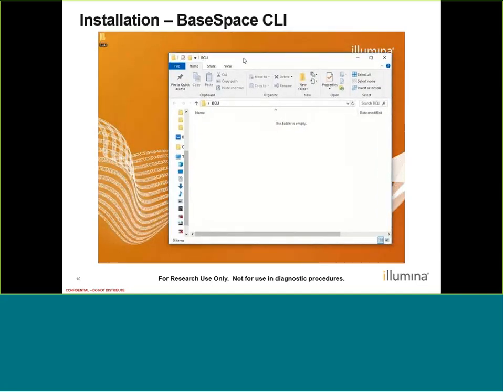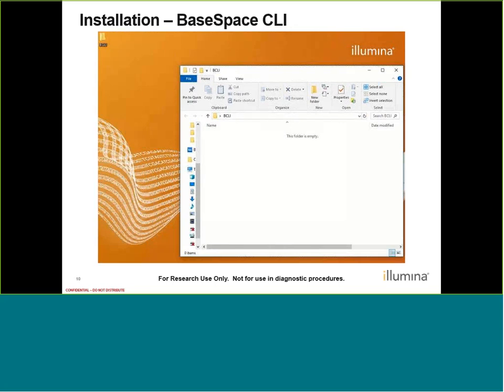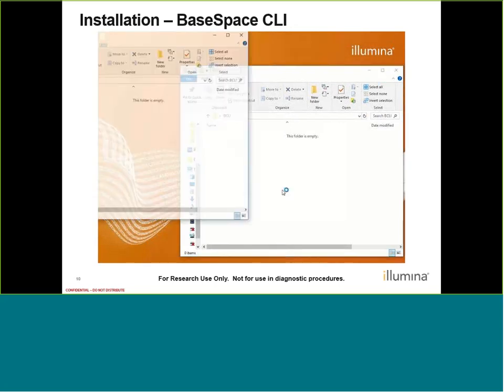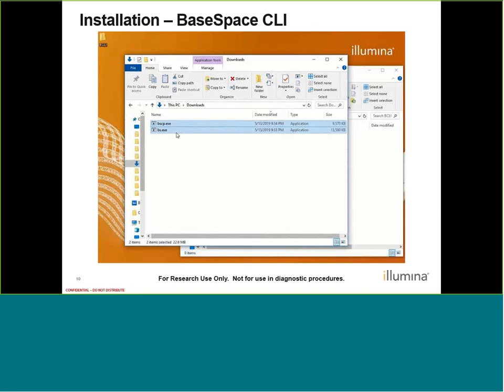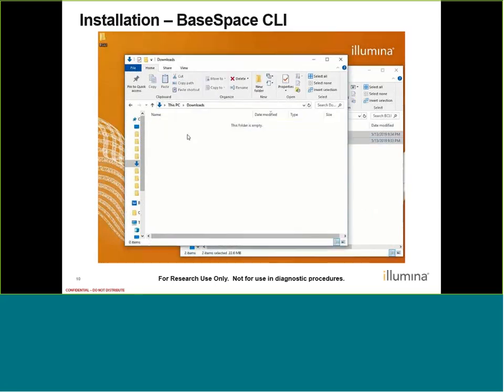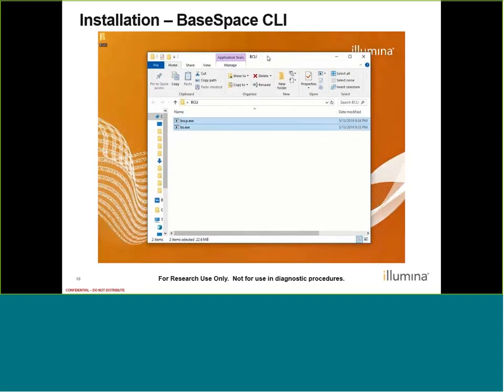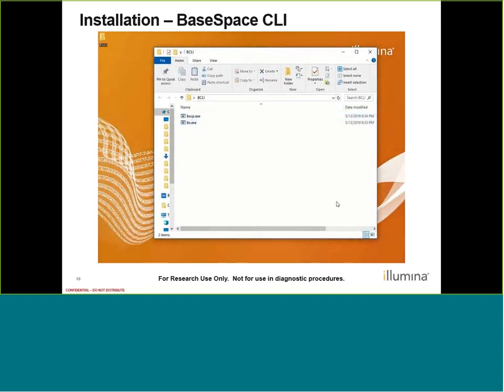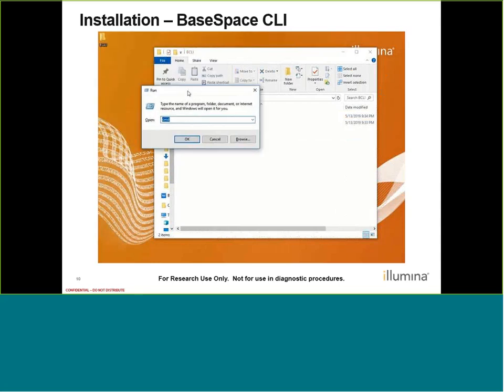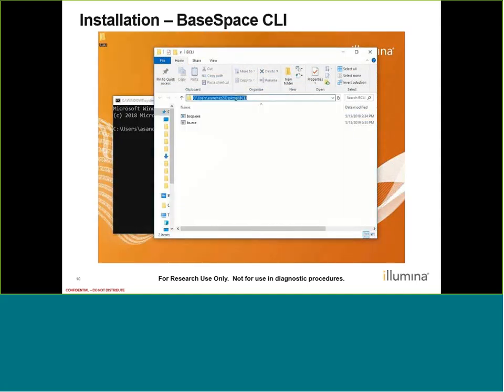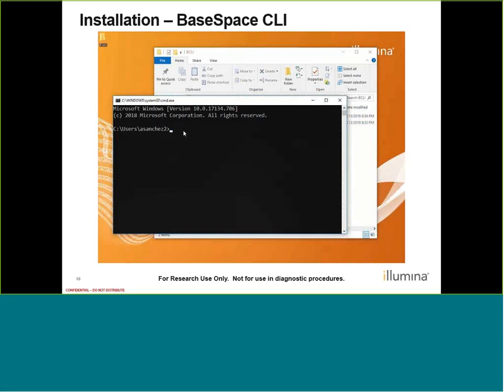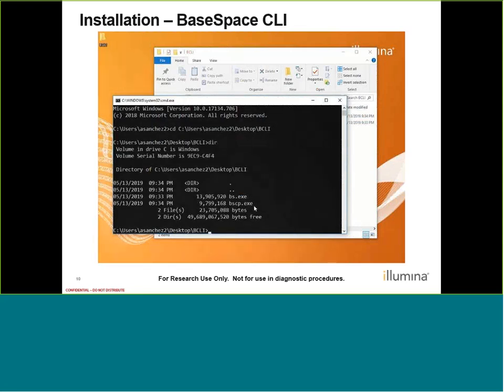I'm going to open my directory that I created and also open a new folder browser. I'm going to go to my downloads and move those two scripts out of the downloads folder and into the designated folder that I created on my desktop. Now I have my two scripts where I want them, so I'm going to open the Windows command line. I just typed the Windows key R, but you can also type CMD to open this up. I'm going to grab this directory path and CD into it. And I'm going to type DIR just to make sure that my files are here — and I see them here.